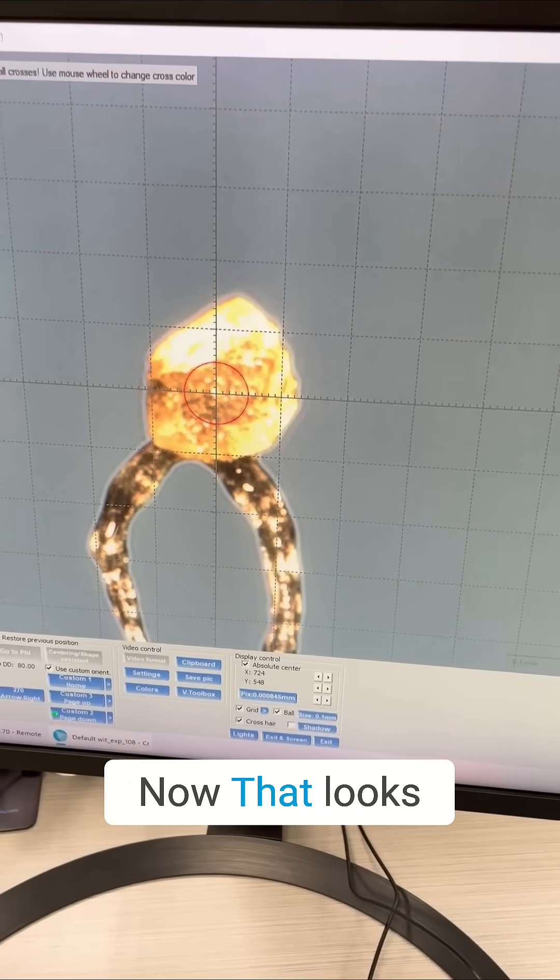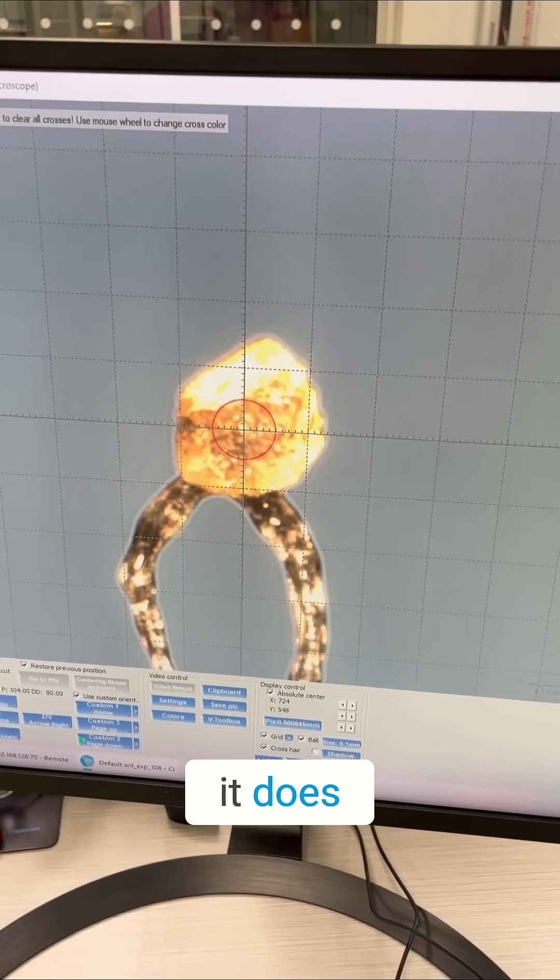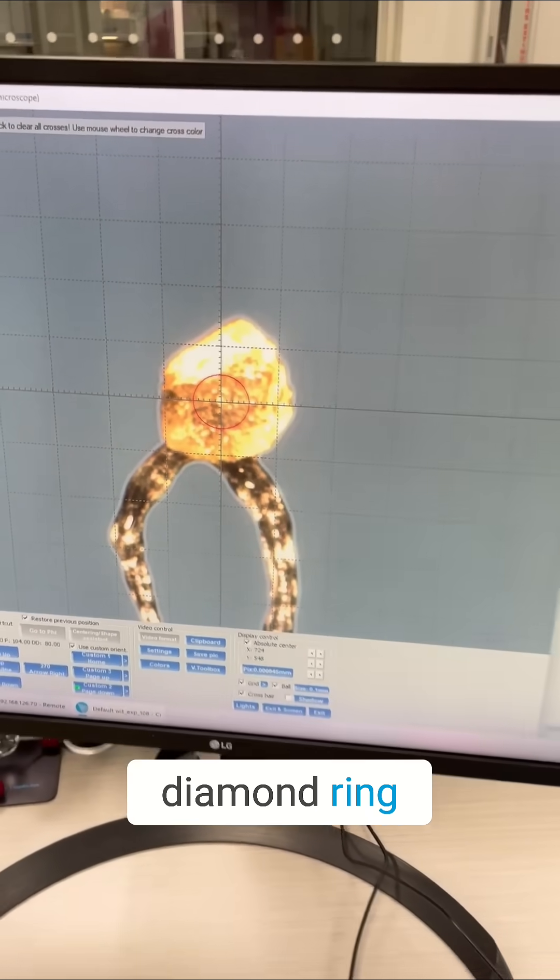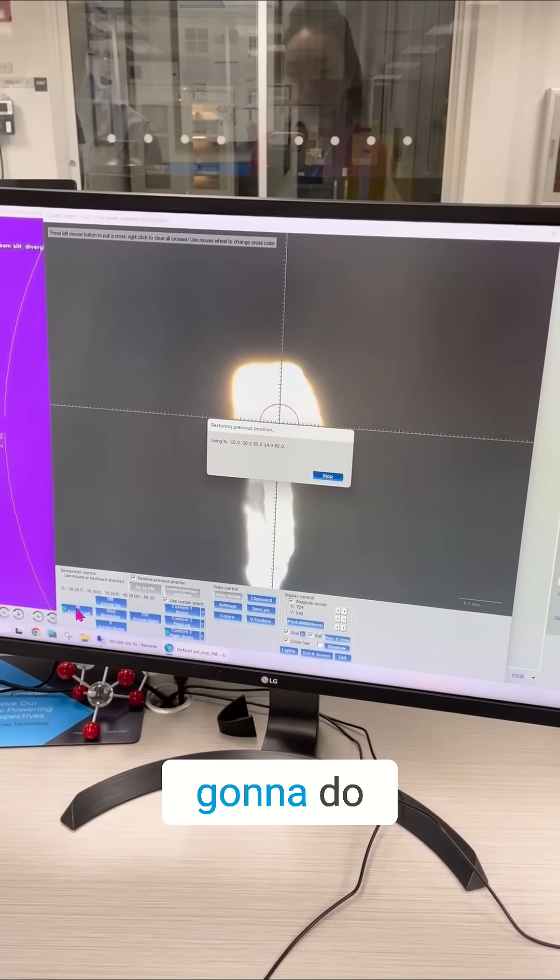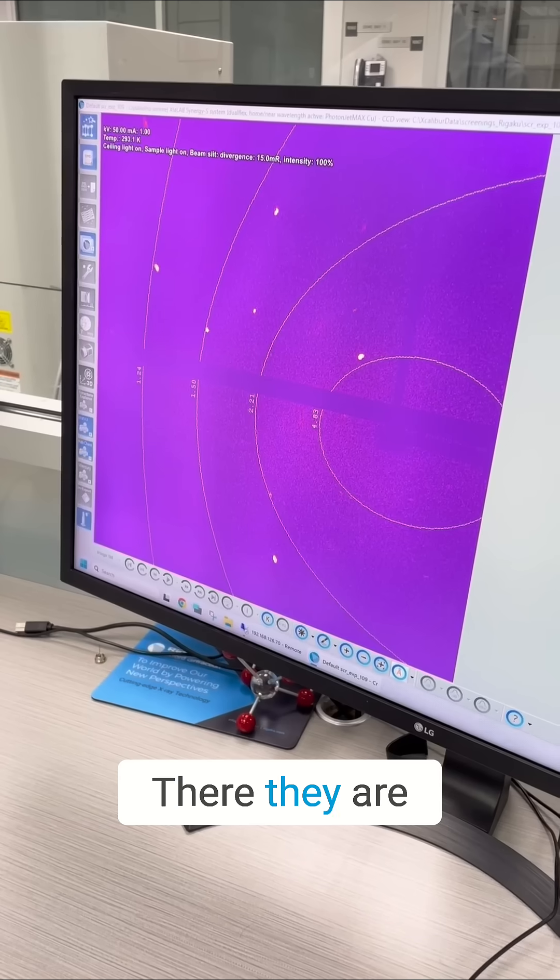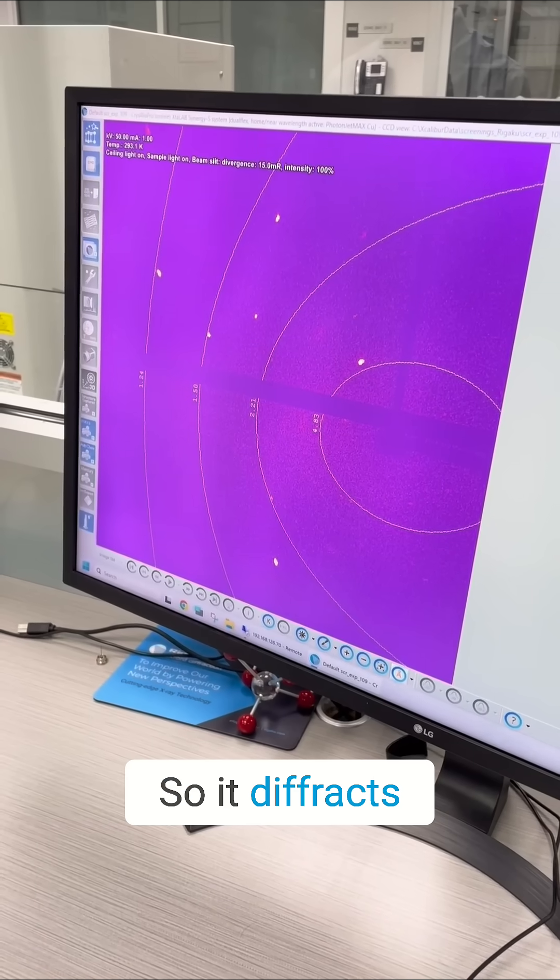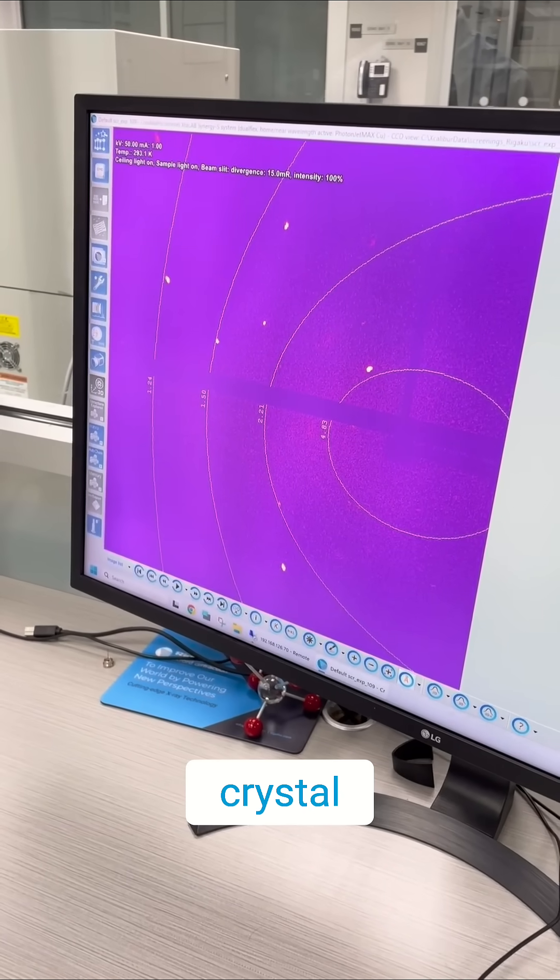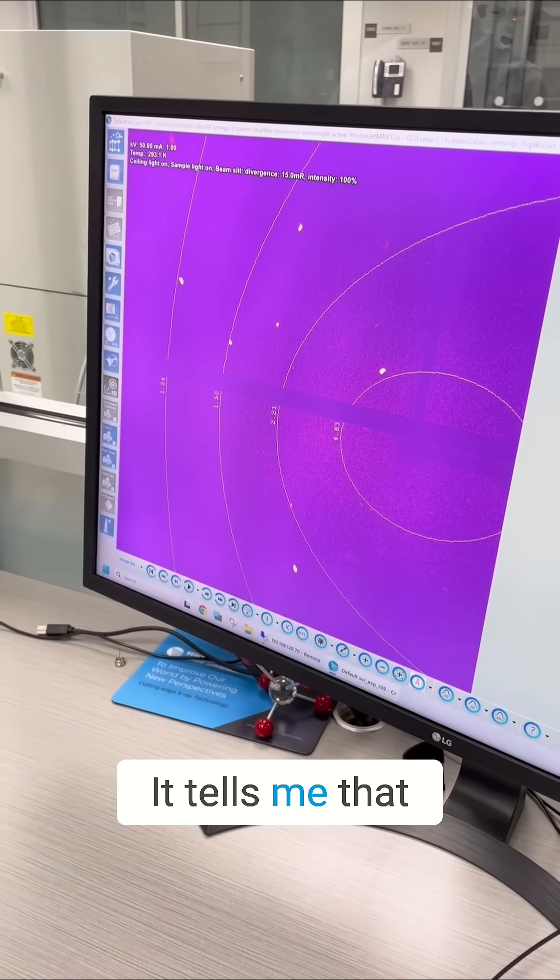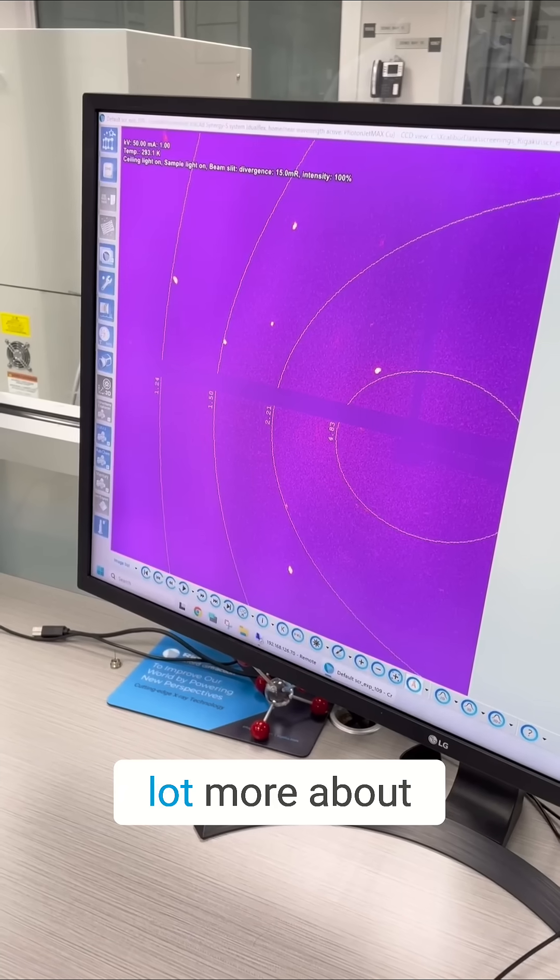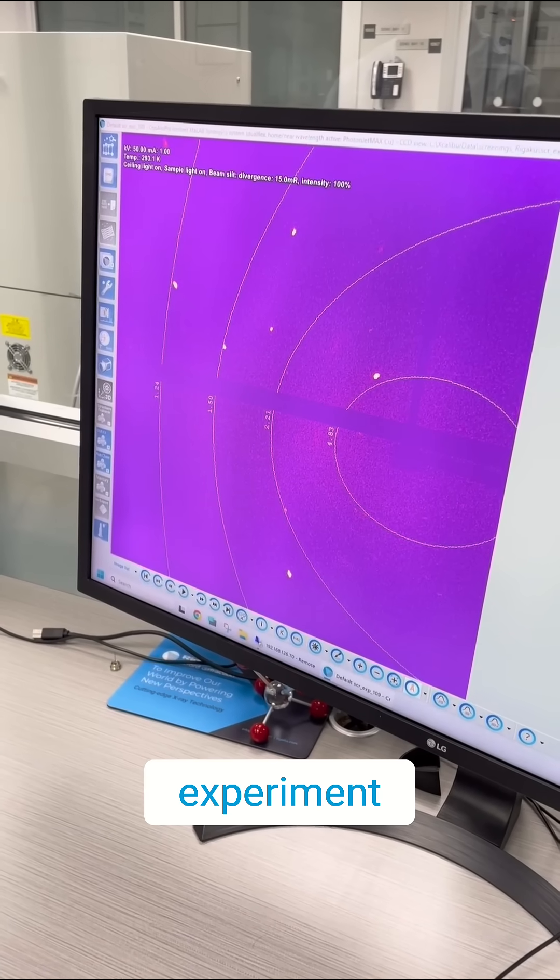Now, that looks like a ring. Yeah, it does. It looks like a diamond ring. First thing we're going to do, we're just going to check to see if it is a crystal. There they are. See all those spots? So it diffracts x-rays. It is a good crystal. It tells me that I can learn a lot more about this if I just do a simple experiment.